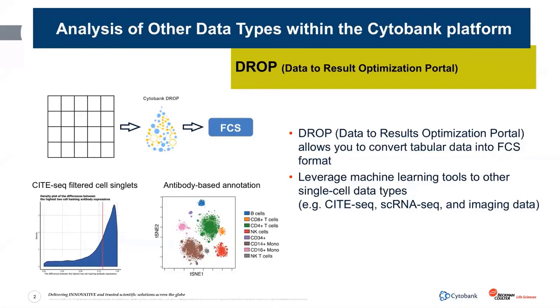For image data, I will briefly describe the workflow, but it is very similar to what you will encounter when analyzing single-cell sequencing data.